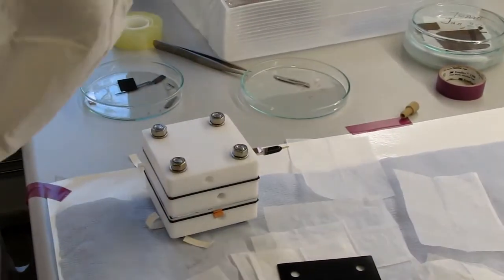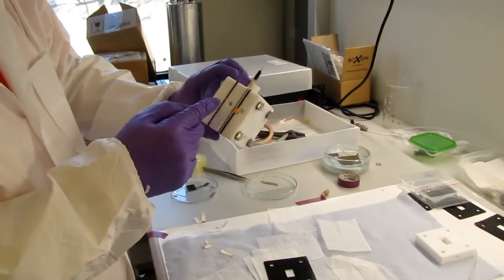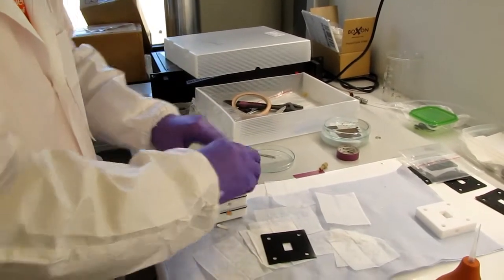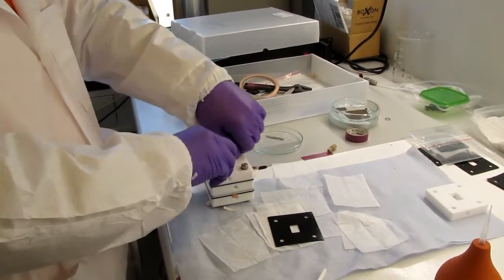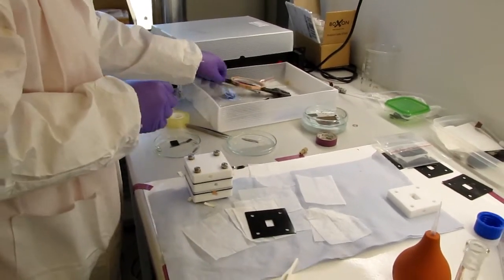You can make the interface between your catalyst, gas, and the electrolyte. So, yeah, you have efficient gas supply and reduce the mass transport limitation. I can make it a little bit tight.